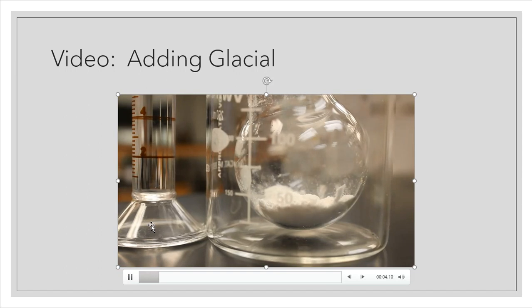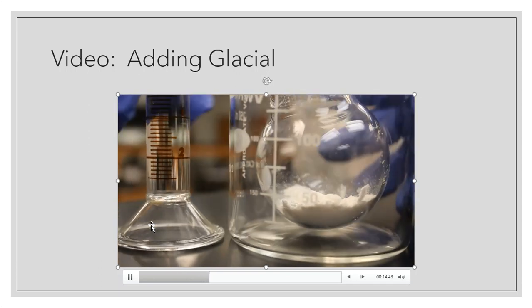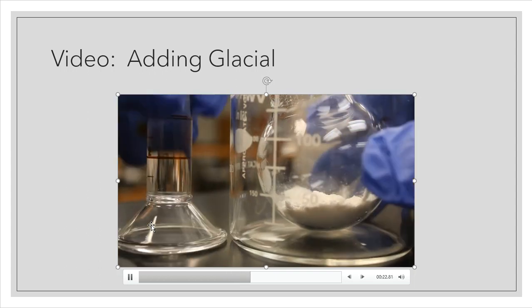What you're seeing in the image is transcinnamic acid. This is a molecule that has a double bond. I'm getting ready to dissolve that in solution. What you see over here to the left is a graduated cylinder, or a part of one, that has 6 milliliters of glacial acetic acid, the strongest acetic acid that I can use in the lab.